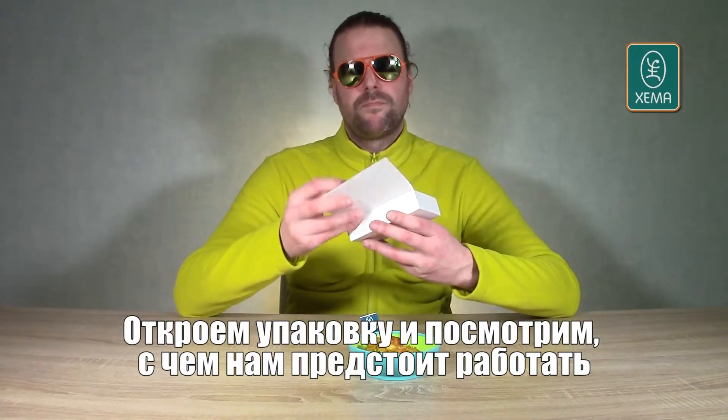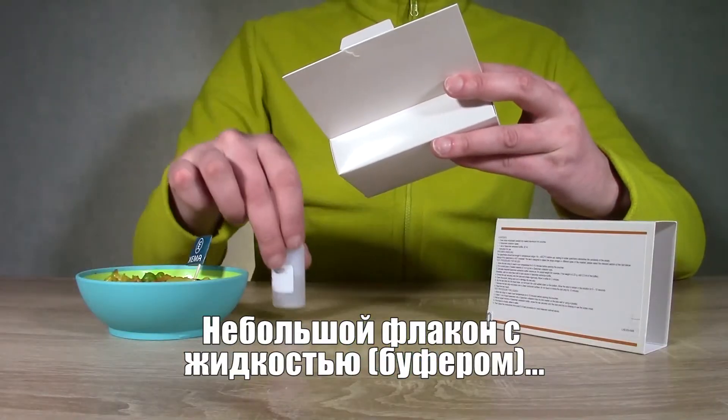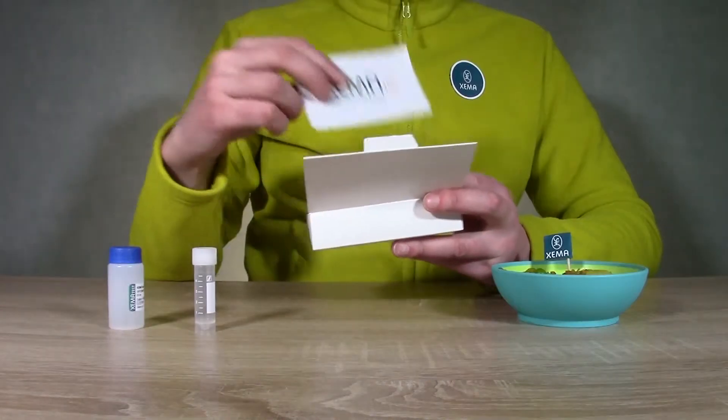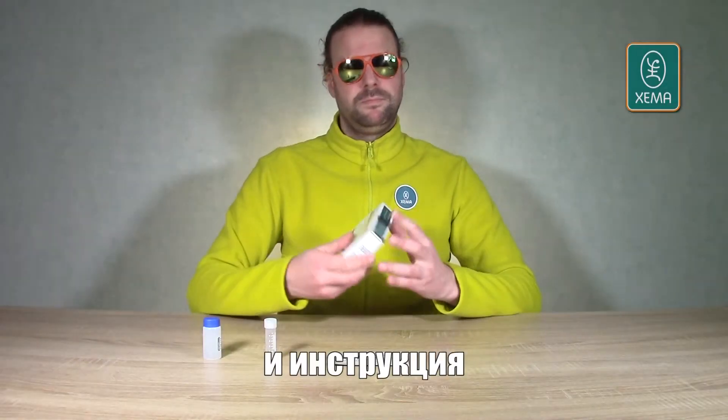Let's open the box and see what we have to work with: a small container with extraction fluid, some collection tubes, some test strips, and the instructions.